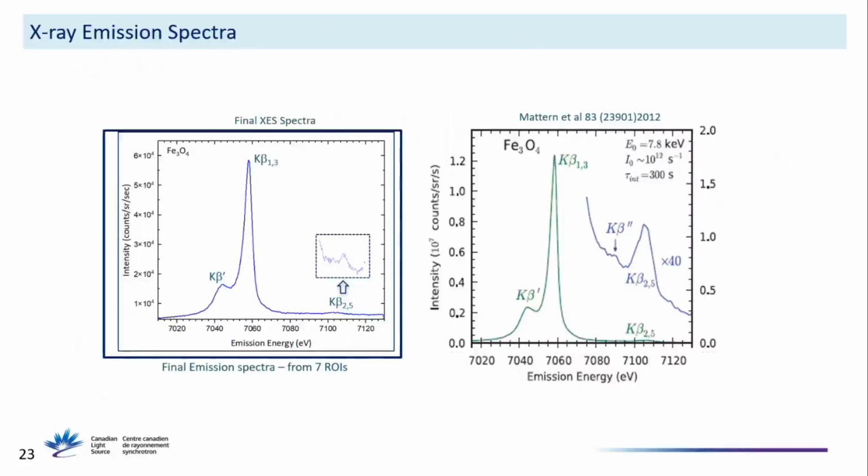But the reason being, their beam size is less than 30 microns. Our beam size is around 200 microns, 150 to 200. So if we make the beam size smaller and reduce the air scattering a little bit, then we'll be able to resolve exactly the same way.